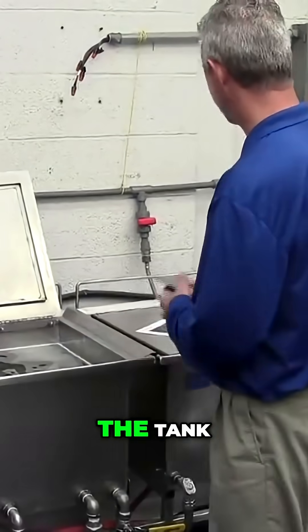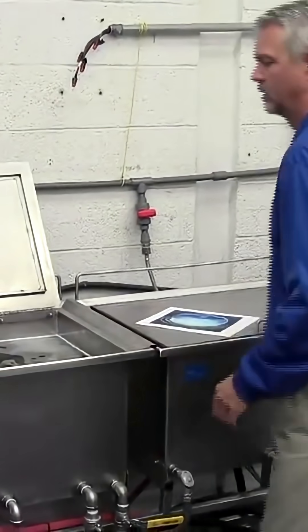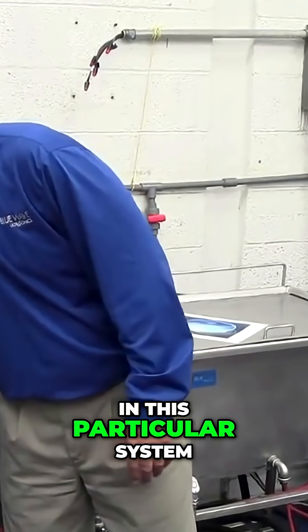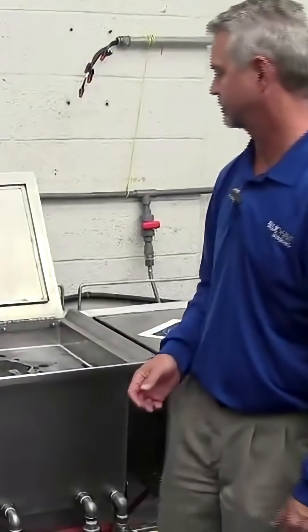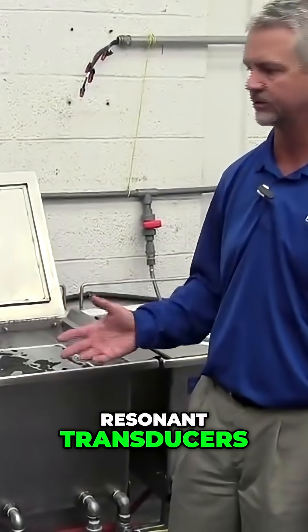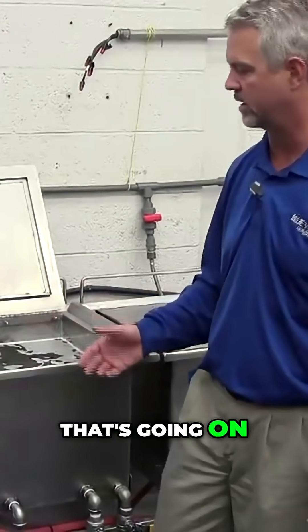So when we turn on the tank, we're actually going to vibrate the bottom of it 30,000 cycles a second in this particular system. What you're hearing there is the resonant transducers and the mechanical vibration that's going on.